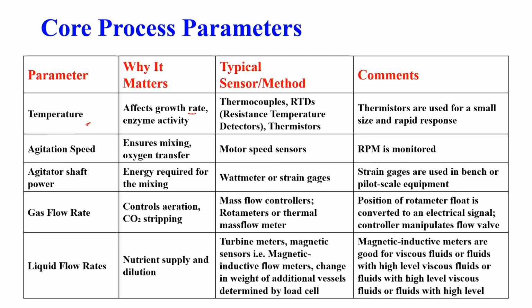So, it affects the growth rate as well as the enzyme activity. And how is it typically monitored? Using thermocouples, resistance temperature detectors (RTDs), and thermistors. For the small size and rapid response, thermistors are mostly used.